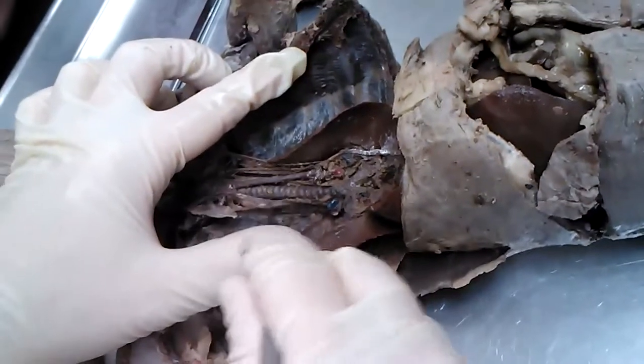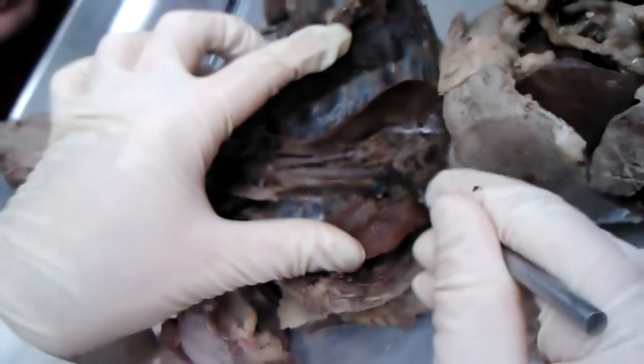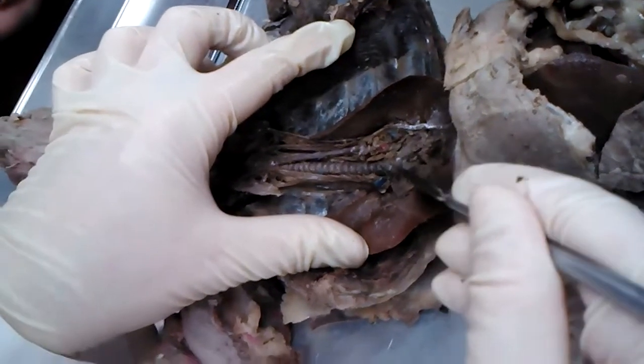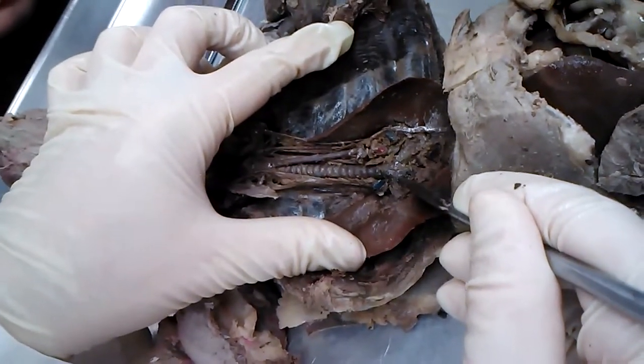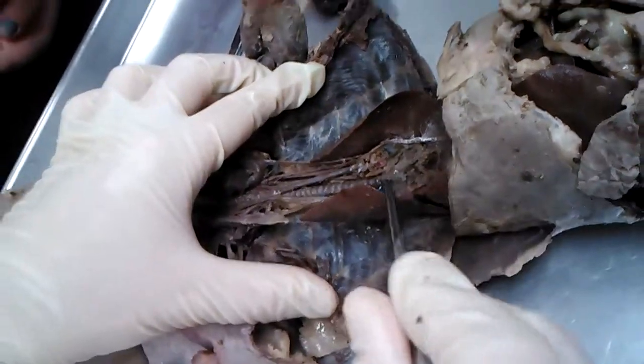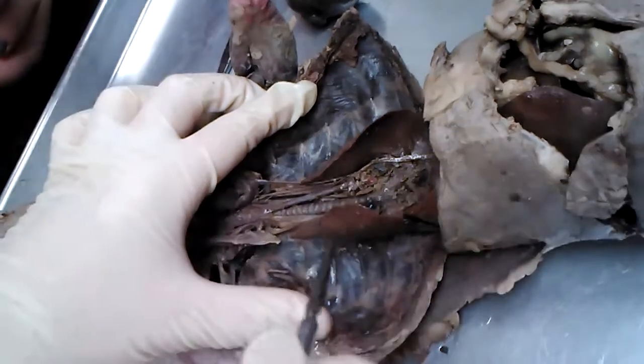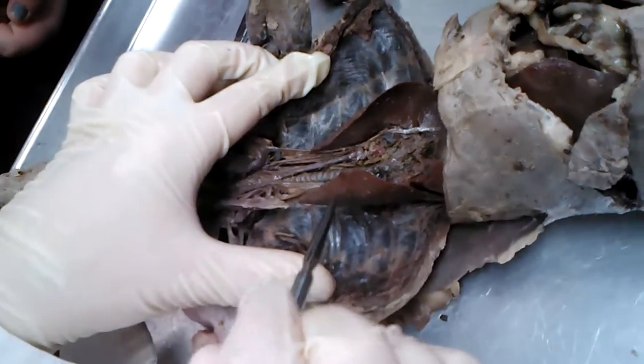Okay? Going back into the thoracic cavity, again, here is our trachea going downward to branch into the bronchi. So on this side, you see a left bronchus. Here is a right bronchus. Okay? Then we also have the mink's lungs. The mink's left lung just had 2 lobes. We had a superior lobe, inferior lobe. The right lung had 4 lobes.